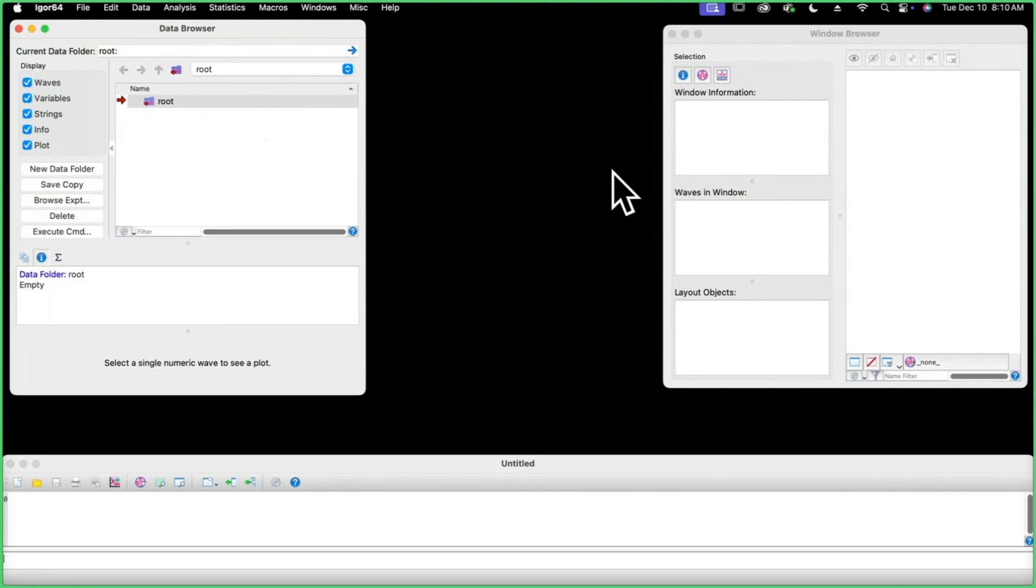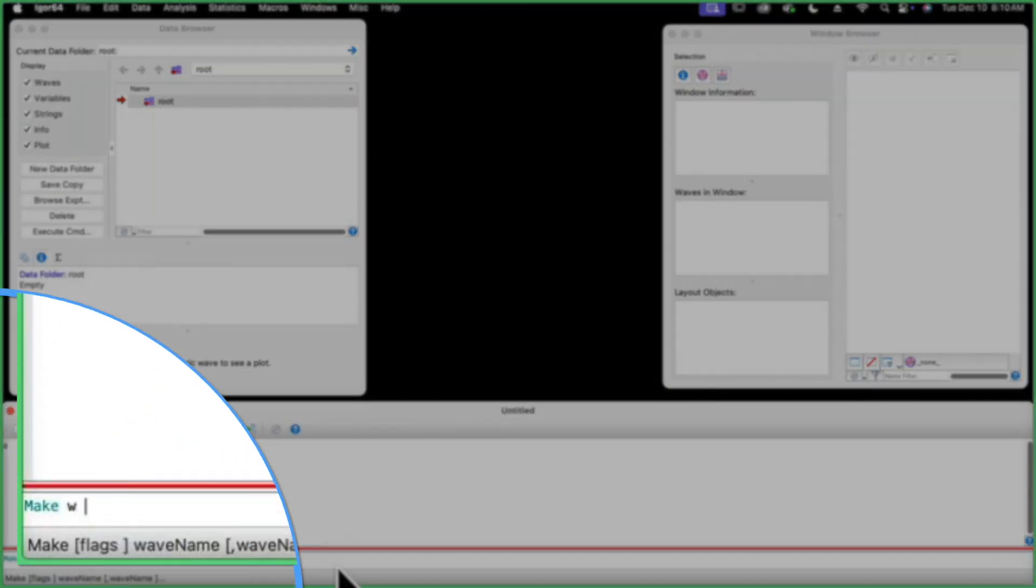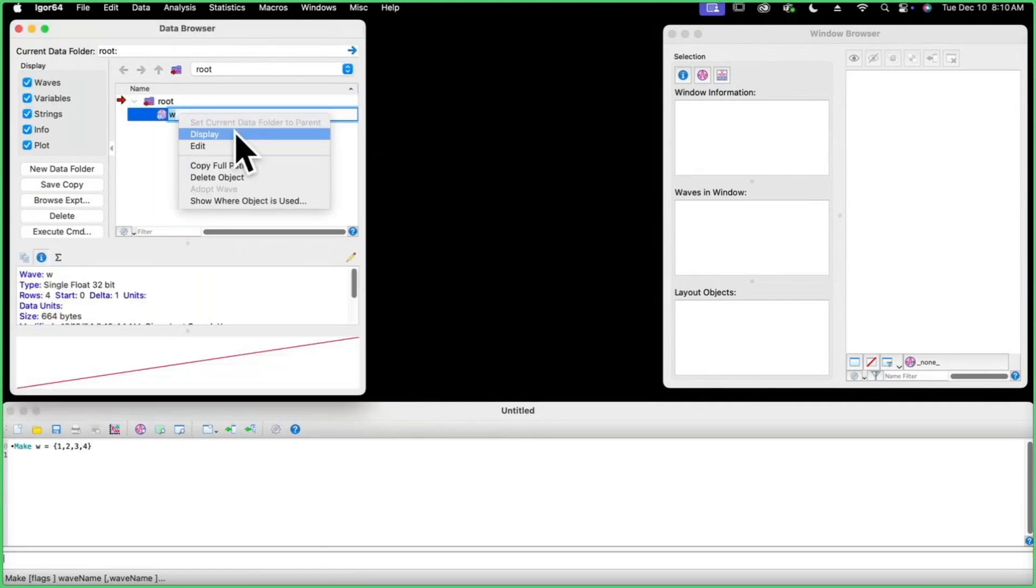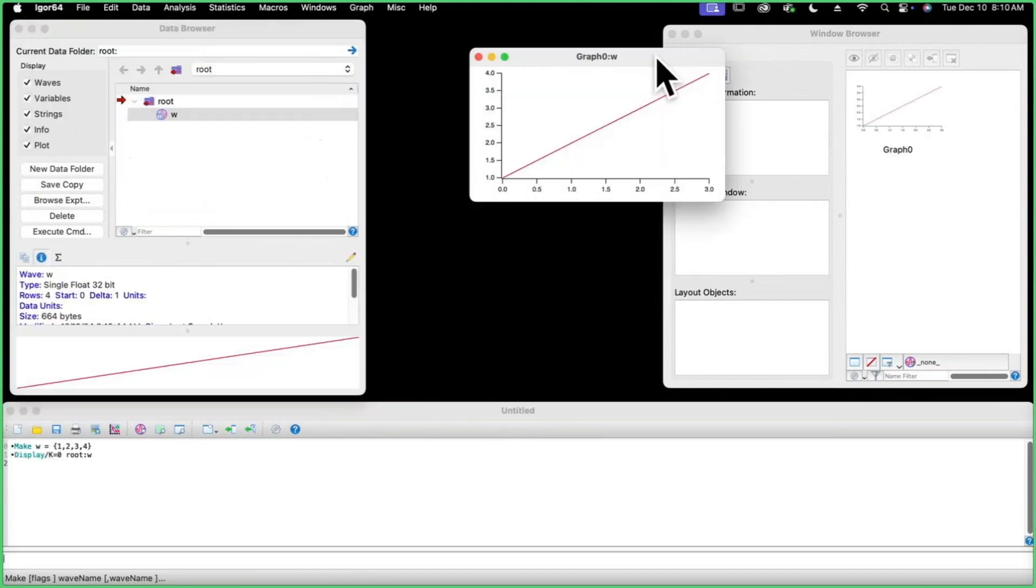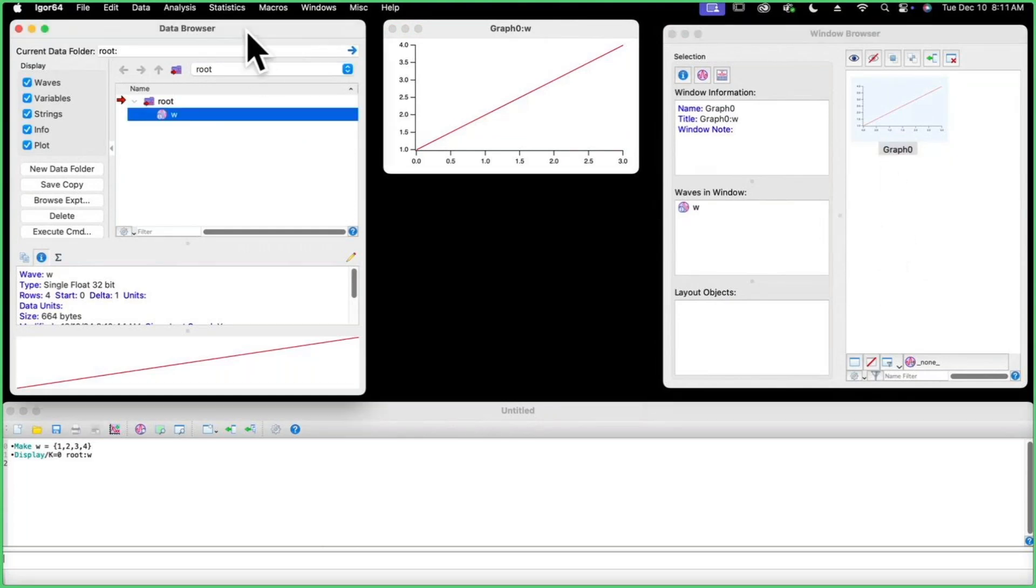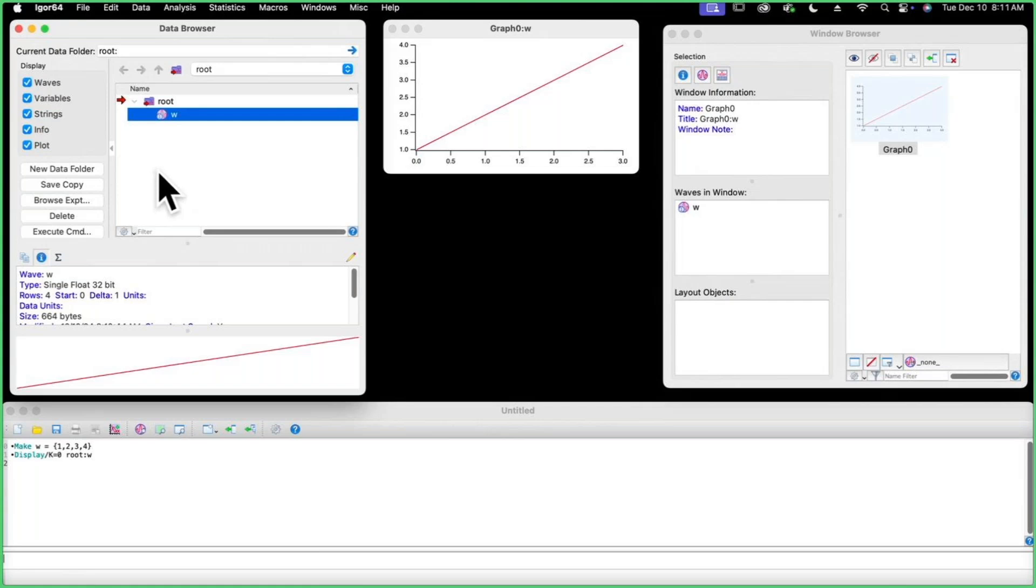This is Igor Pro that I have up right now. Here is the command window where you can type in commands. I'll just make a quick wave, name it W, and put some basic data in it. If we display that as a graph, you can see in the window browser my available graphs and tables. Here is the data browser that shows all of the waves that I have created. An experiment is the word for a collection of Igor objects, and these objects are stored in an experiment file that has a PXP file ending.